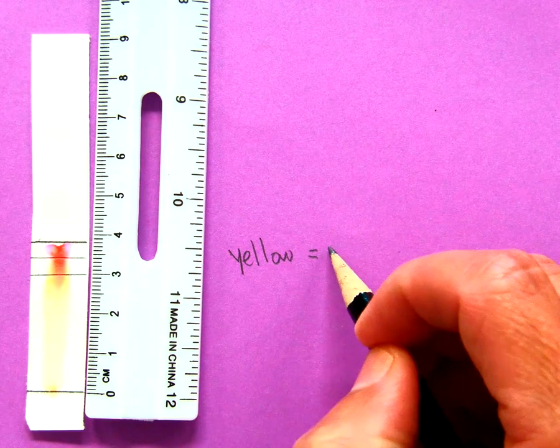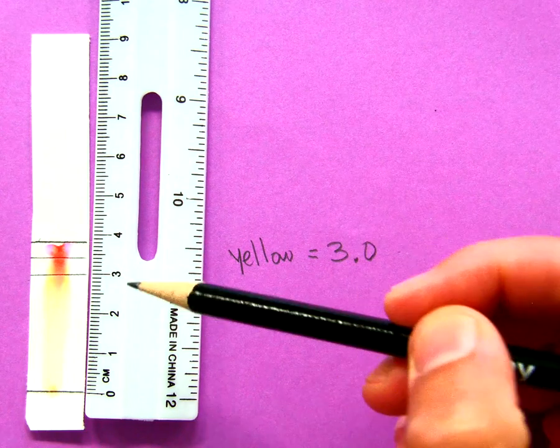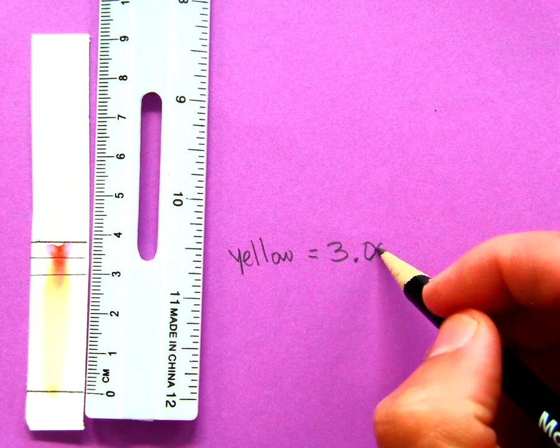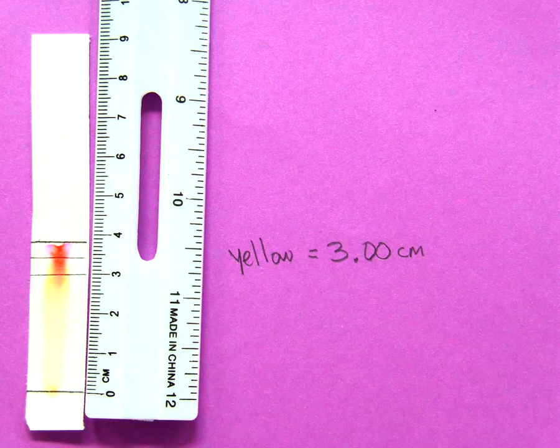Okay, and I'm going to write 3.0 because I think it's right on this mark. And even in between these two marks, I think it's exactly on the line. So I'm going to write 3.00 centimeters, and that's for the yellow.